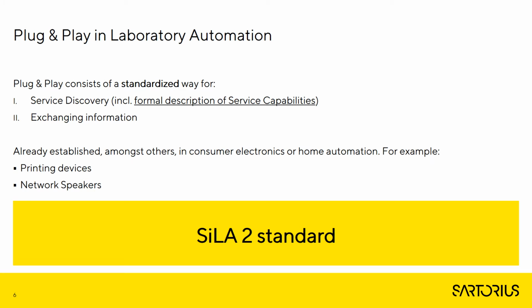First of all, I want to talk about the plug-and-play concept in laboratory automation. Plug-and-play consists of a specified way for service discovery, which includes a formal description of the service capabilities, as well as a standardized way for exchanging information. This is already common in industries like consumer electronics or home automation.